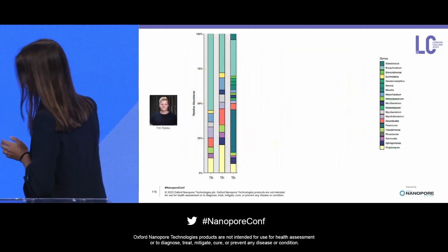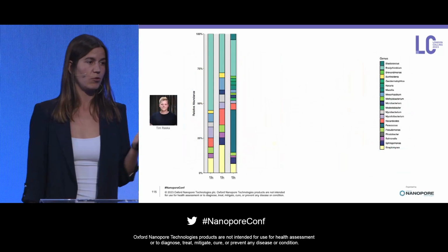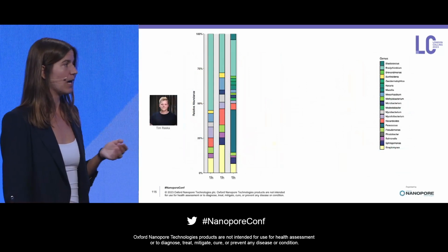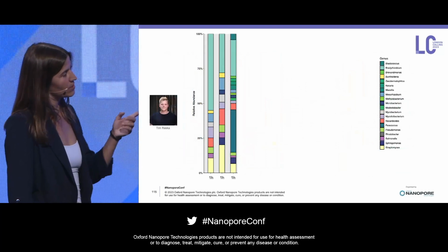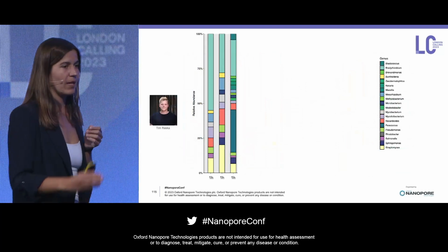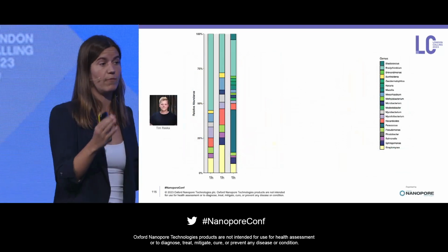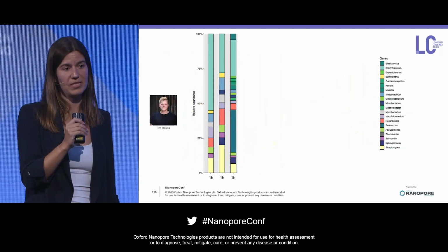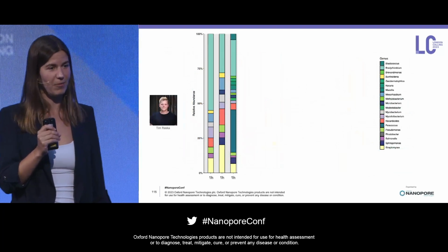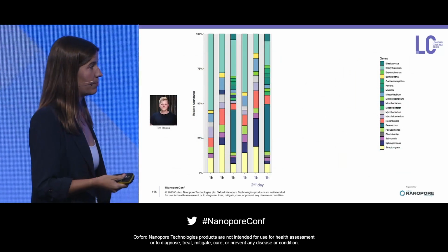So what Tim in the lab did, he went into a more controlled environment, into a greenhouse on our campus, and sampled air, again using the cyclonic technology. And here you see 3 air samples from 1 hour of sampling that were taken consecutively, one after the other. And we see quite high variability between those samples, which is not a good thing, right? Because we can therefore not assess the microbiome in a robust manner.